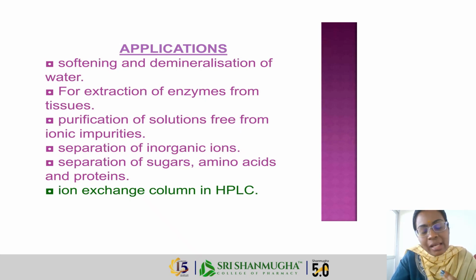Then separation of inorganic ions. Inorganic means compounds not containing carbon, and organic means compounds containing carbon. And separation of sugars, amino acids and proteins. So the ion exchange column in HPLC.